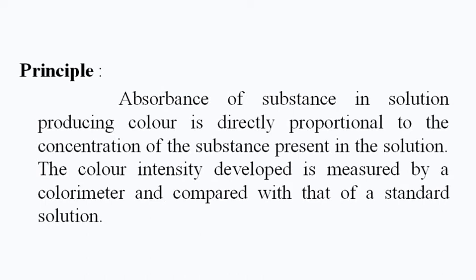And today's experiment principle will be that the absorbance of a substance in a solution producing color is directly proportional to the concentration of the substance present in the solution. So the color intensity developed is measured by using a colorimeter, and it is compared with that of the standard solution.